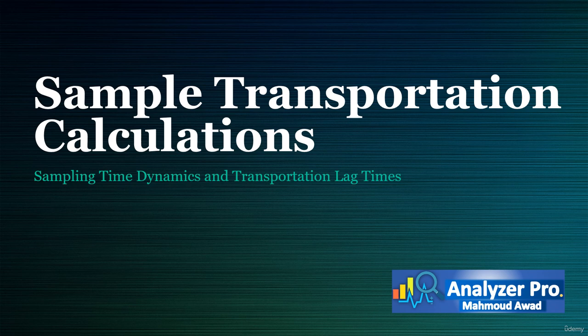We also will learn more about Reynolds number and how it is calculated. And finally we will discuss the pressure drop that happens during transporting the sample through the sample line till it reaches the analyzer, to make sure that the sample will reach the analyzer with the appropriate pressure for analysis.